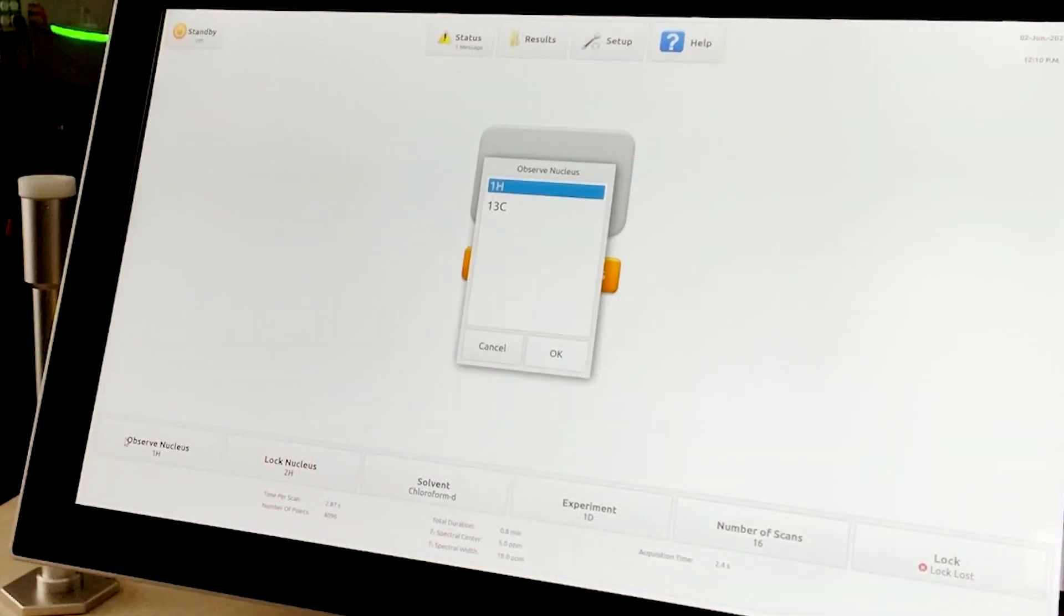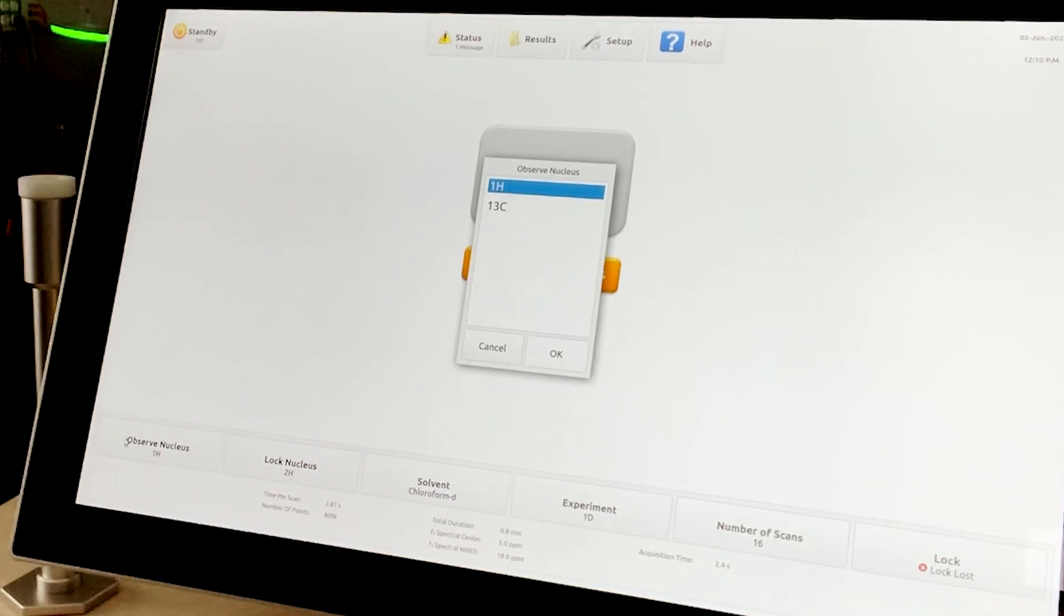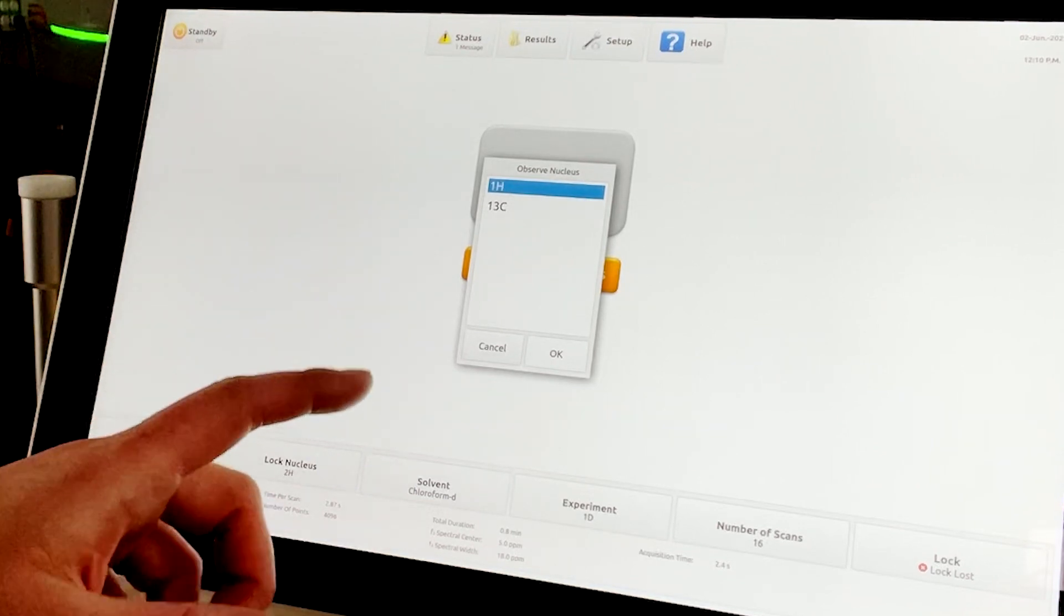The software interface is very similar to our 60 MHz product line for those that are familiar with this. The main window has a series of quick select buttons available. The first allows the user to select the nuclei they would like to observe. This model is a Proton Carbon 100 Pro. For this demo video, we will acquire a Proton NMR spectrum.